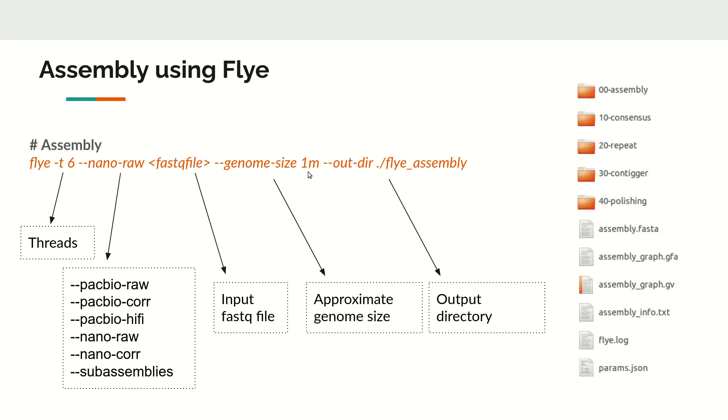Then you have to give the output directory where you want to dump results. Here let's create a folder and dump the result into the flye_assembly folder.